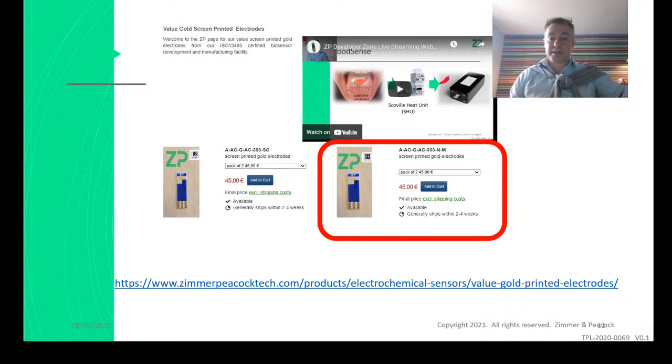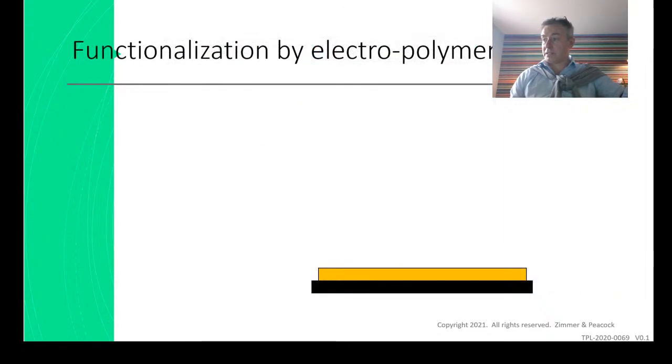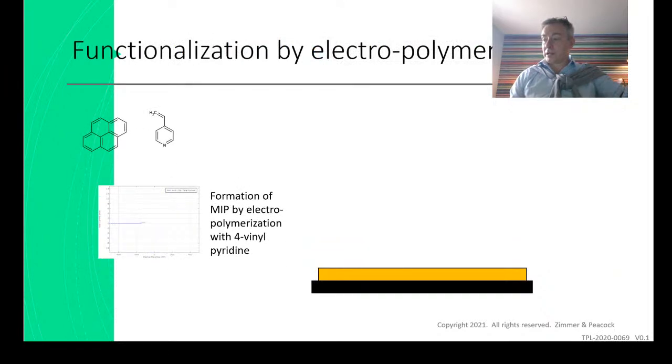So can I recommend an electrode? Yes. Why can I recommend it? Because we've got a paper on it and we hope that helps. In the paper, we describe, take the gold electrode. Every time you do a CV or a cyclic voltammogram on it.